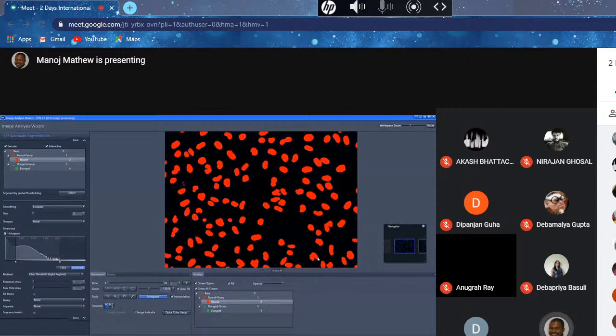You see the red color here. And we have different algorithms to do segmentation. Otsu is actually the name of a scientist who developed that algorithm, and Otsu is one of the most common intensity-based segmentation algorithms. There are a few other algorithms as well. For every algorithm, there are two flavors: the light regions option or the dark regions option. What does that mean?